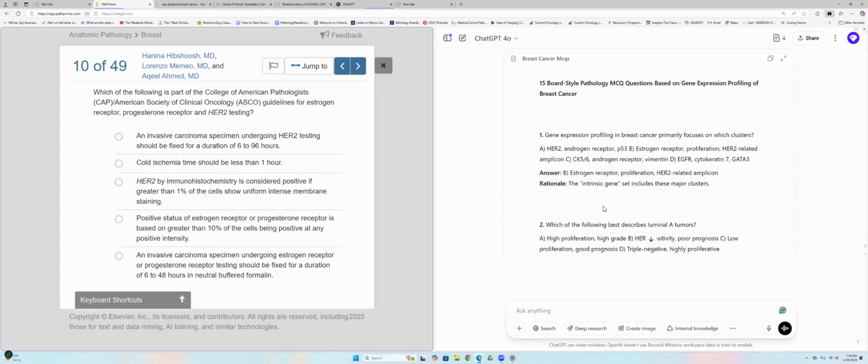You take photographs of the cut surface of the tumor, to look at the size of the tumor. The photograph will show the size of the tumor in relation to the inks. You don't need to do all the measurements, just take a quick photograph, then wrap it and put it in formalin. That way you increase the surface area where formalin penetrates and fixes the tissue better, which is good for immunohistochemistry and molecular testing. If the cold ischemic time is very prolonged, molecular testing gives you bad results.